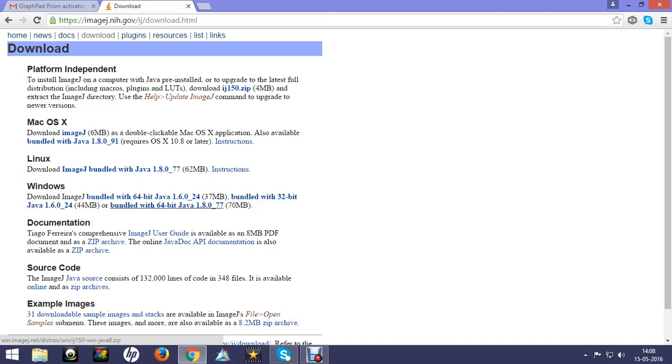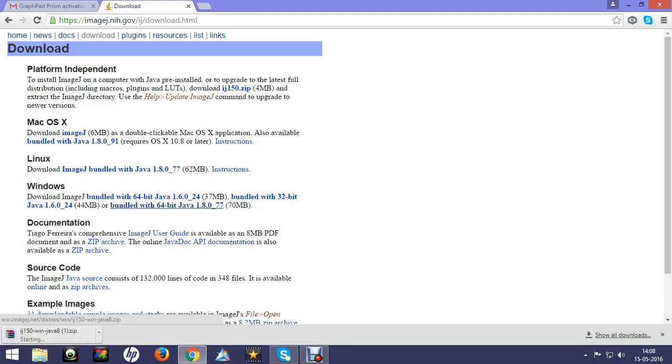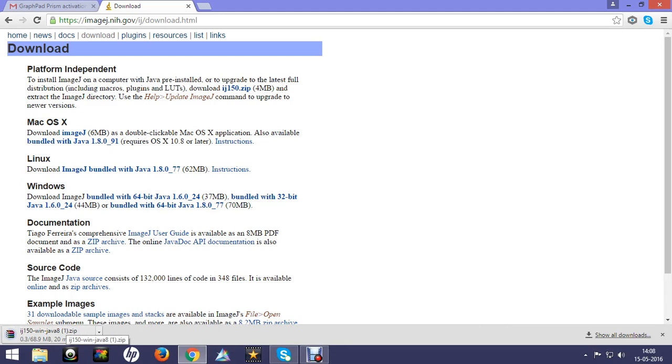As my computer is 64-bit and it runs Java 1.8.0, I will click on this particular version. After clicking on it you can see it starts downloading.